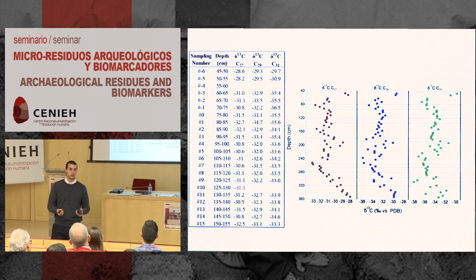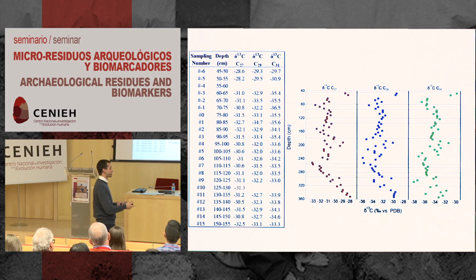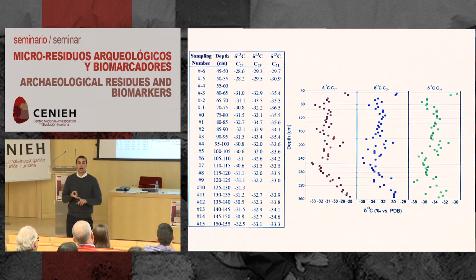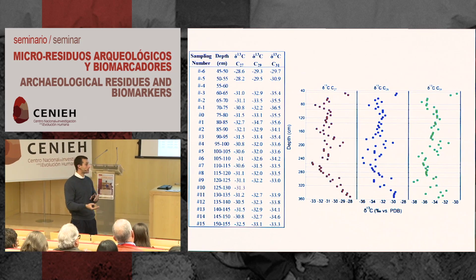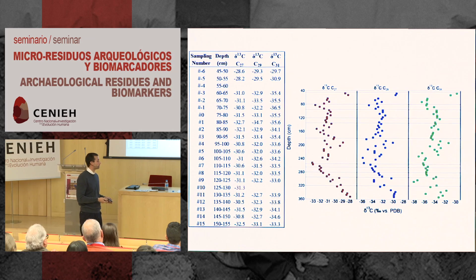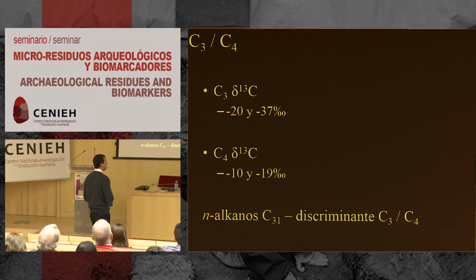This is important because if you're interested in a particular environment, you need highly synchronized data. Otherwise, you know your sources are totally different. If C27 and C29 looked completely different, you know you had an issue with your original sample or the technique itself. If they're unsynchronized, it can cause a problem. It can show you that your data is maybe not what you need for actually giving these ideas on paleoclimate.